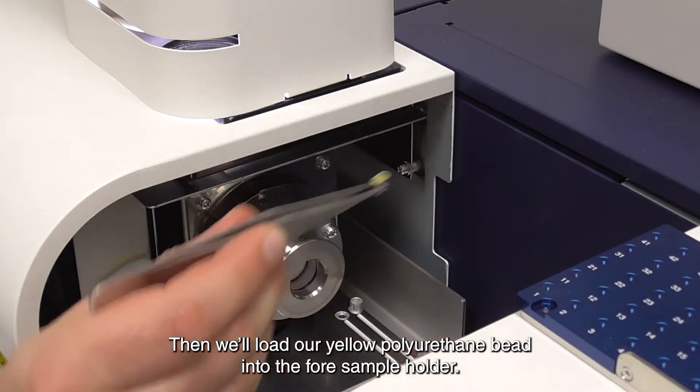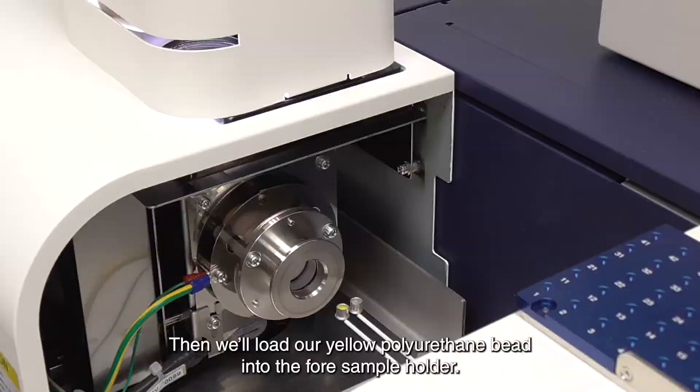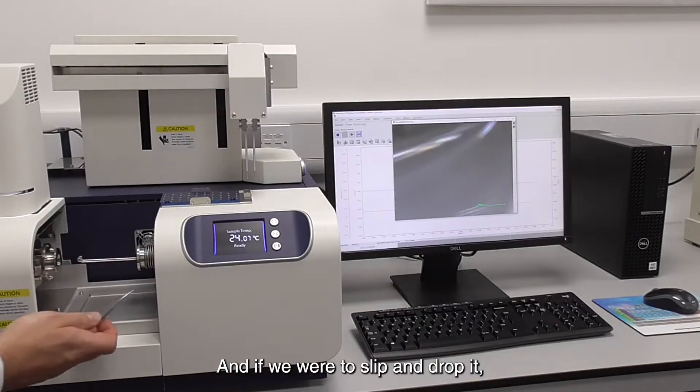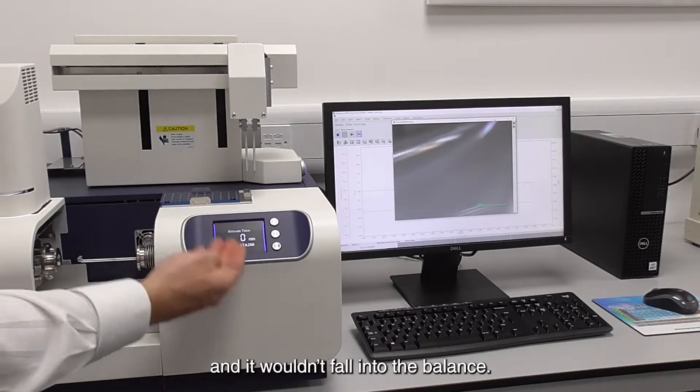Then we'll load our yellow polyurethane bead into the sample holder. And if we were to slip and drop it, this is the easily wipe-cleanable surface that it would fall onto — it wouldn't fall into the balance.